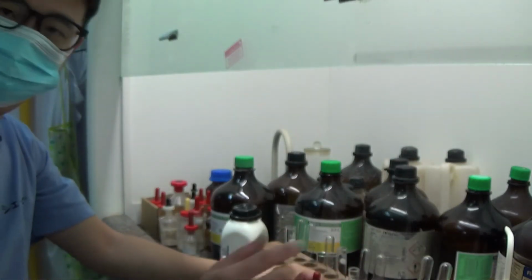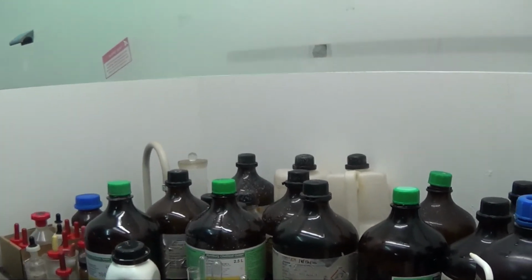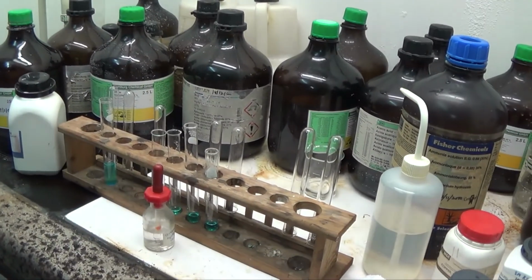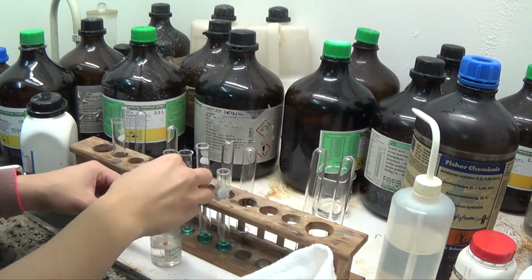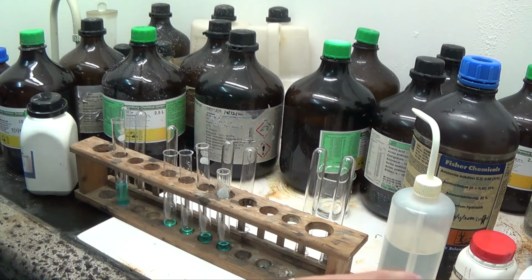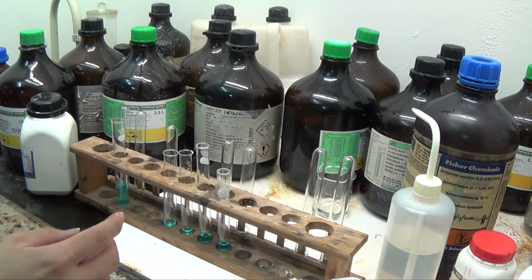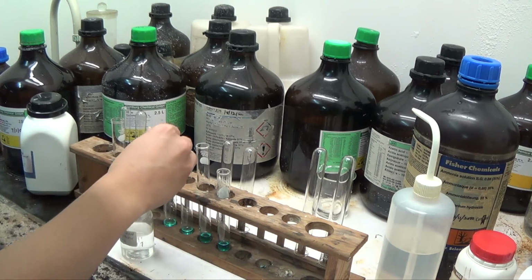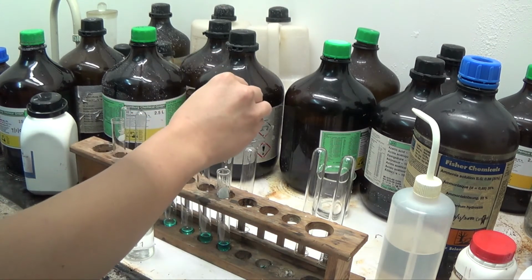So I will just add it onto the pale blue colored solution. I don't want to be testing the concentrated hydrochloric acid out, and that is kind of disgusting, so that is not good. I don't want to use that. Perhaps I can use this. Okay, so this is also concentrated hydrochloric acid. So let's see what happened. Let's choose this one.